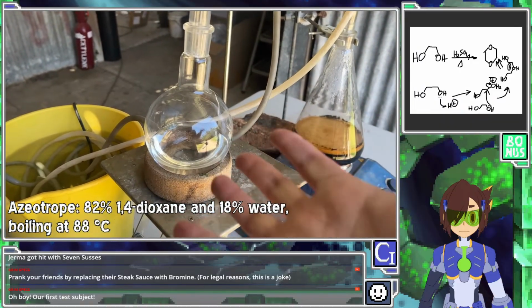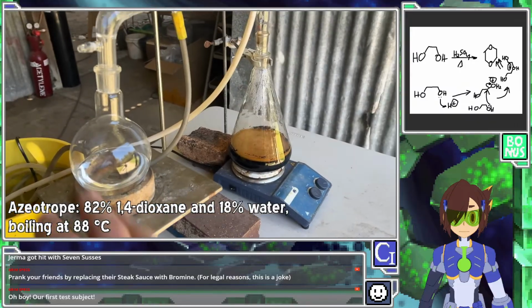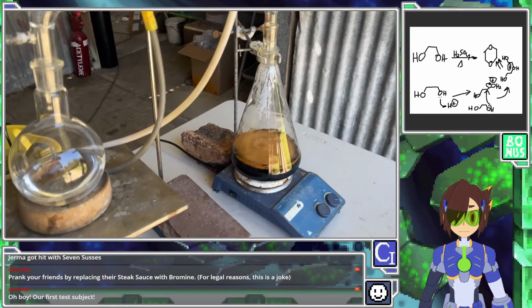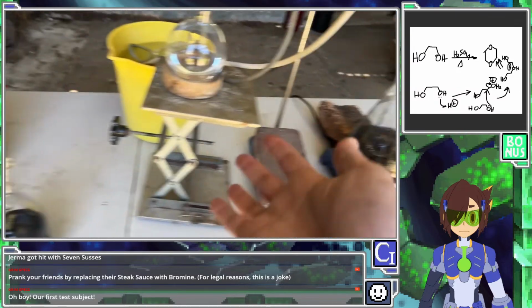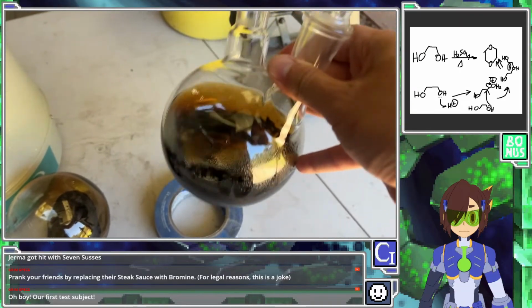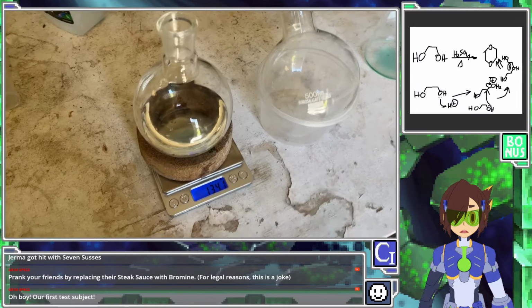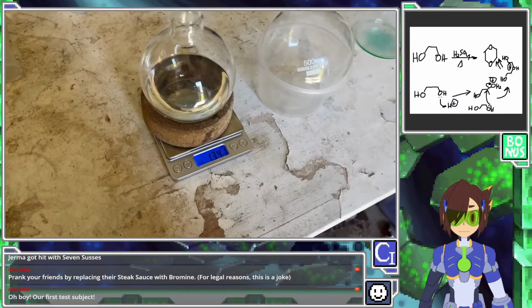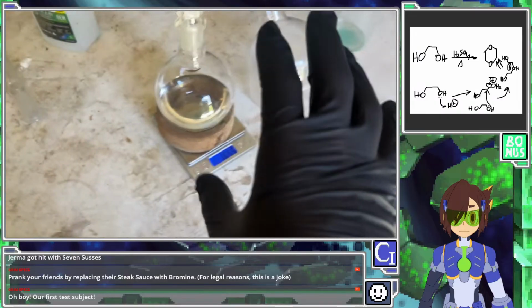We tried to convert a whole litre of ethylene glycol. It should be alright, it should be enough for what we need. Maybe, just enough. But this method I tried to do to improve yields has absolutely cooked the yields. We're only 2 or 3 videos into the series, and I've already generated several monumental tars. Look how thick this sludge is. I've got to clean all this, and I'm ignoring it because I don't want to. It's like a demi-glace. 134 grams of water and dioxane azeotrope. Not only is that absolutely abysmal yields, but I don't think it's enough for what we need.